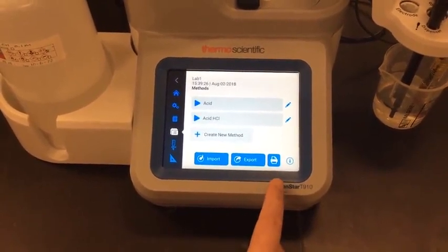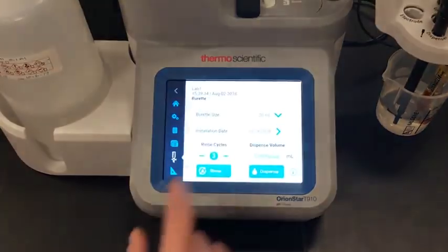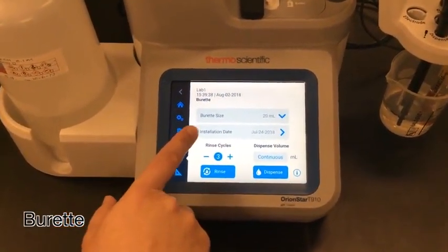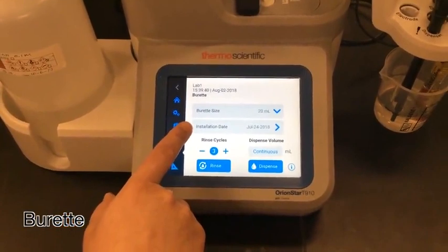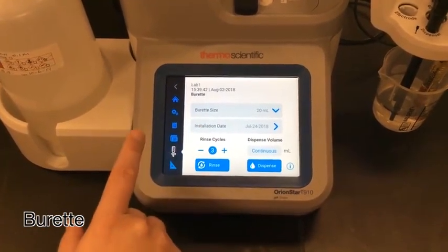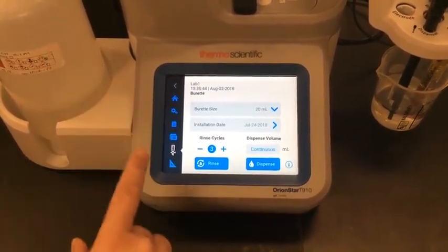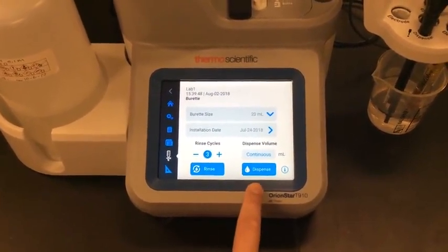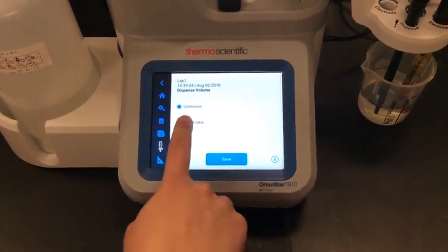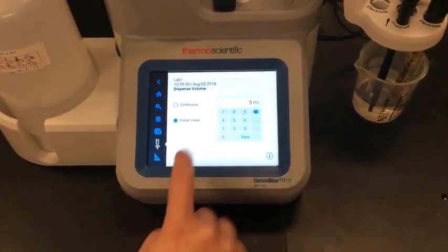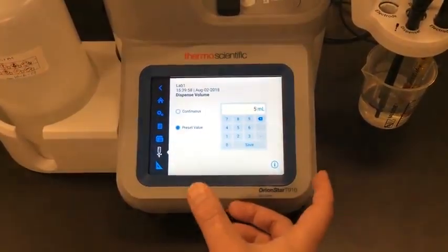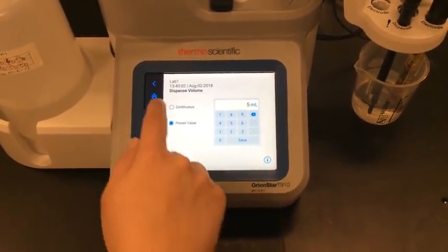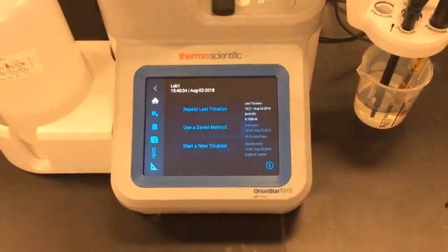I can also print out my methods. The next screen is the burette screen. From here I can set my burette size, enter the installation date, and use that to set a maintenance reminder to replace the burette. I can rinse the burette or dispense a certain volume — using continuous mode in case I see an air bubble in my lines, or I can select a preset value and dispense five milliliters five times to make sure that my dispense accuracy looks good.